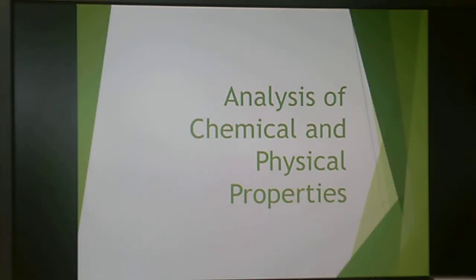In the previous lecture, we talked about how to analyze mechanical properties, but mechanical properties are not the only properties that are important to understand when you're looking at polymers or plastics. So I'm going to talk a little bit about the chemical and physical properties analysis that is often performed.